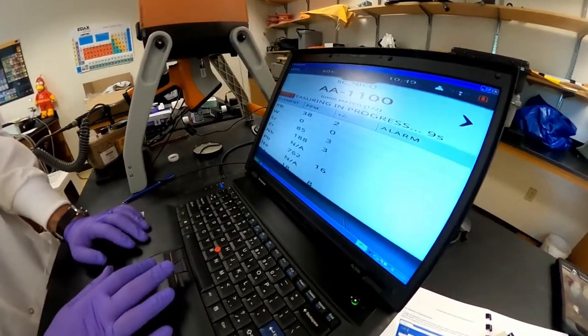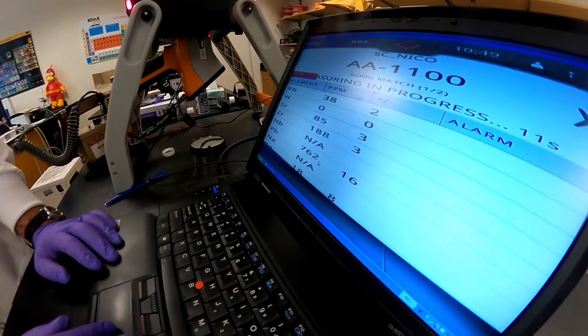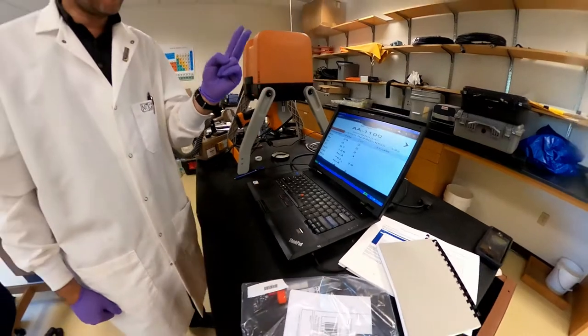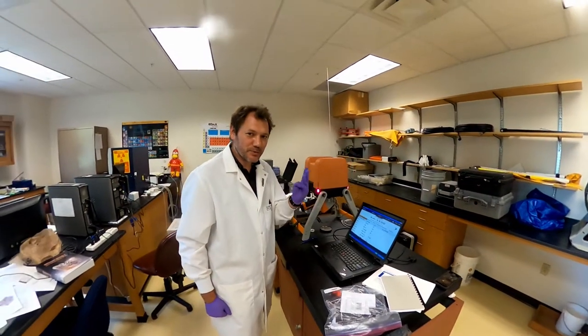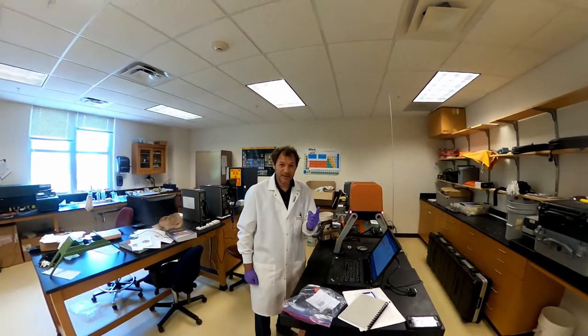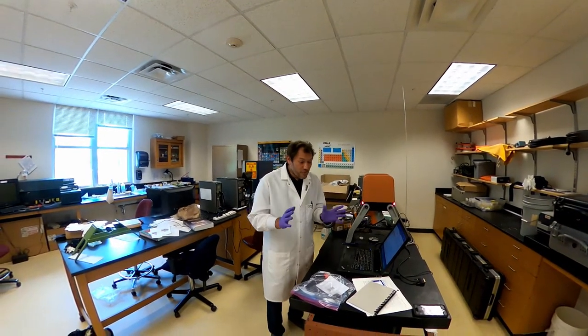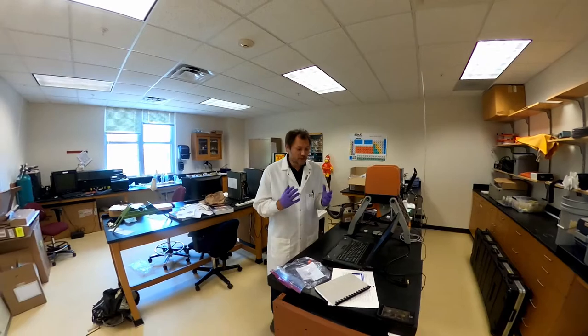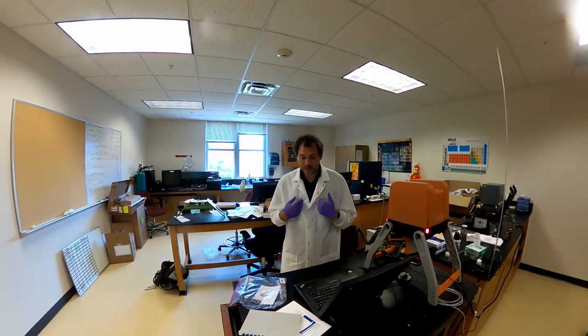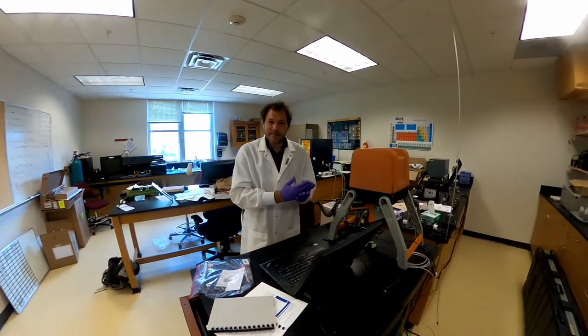While the measurement is going, we start seeing some results. And look at the lead. This is, remember, a composite sample. Two samples were far away from the house. Two samples were nearby the house and one sample was in between. So, we represent some of the concentration of lead in the general area of this property, my property.